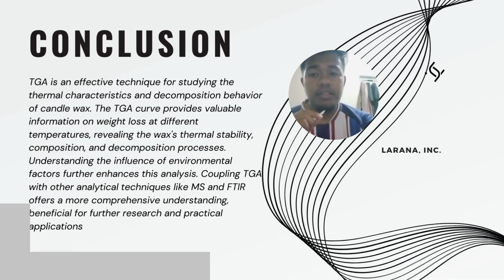In conclusion, TGA is an effective technique for studying the thermal characteristics and decomposition behavior of candle wax. The TGA curve provides valuable information on weight loss at different temperatures, revealing the wax's thermal stability, composition, and decomposition process.